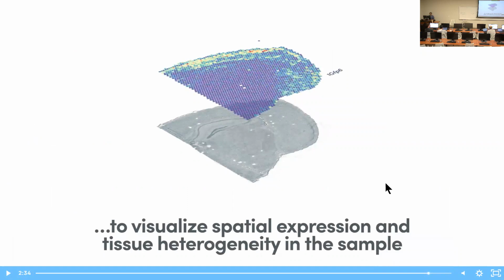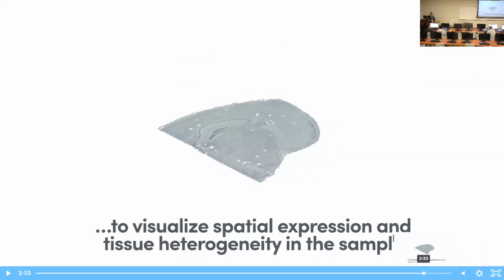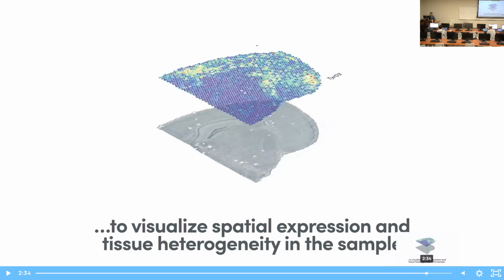You see, once you have this profile, you can look at the different gene expression and their physical location on these different spots. Each spot has thousands of genes you can work out, and you can look at the set of genes, see whether they are always highly expressed in this corner, and what this structure is, what are the feature genes which are highly expressed in this part. So a lot of questions you can ask.